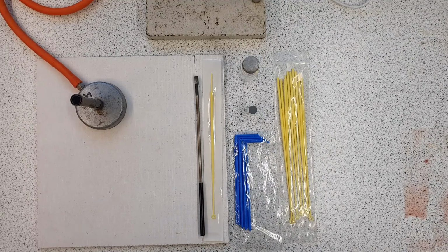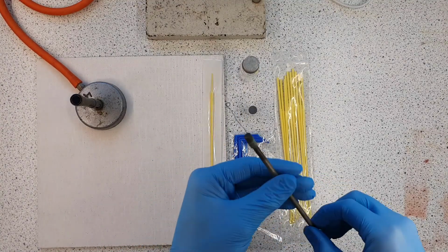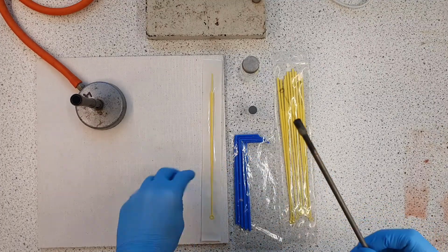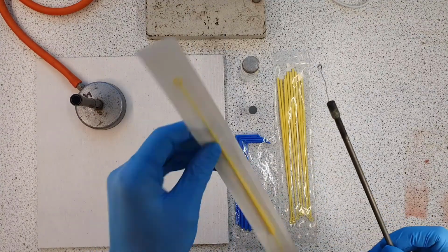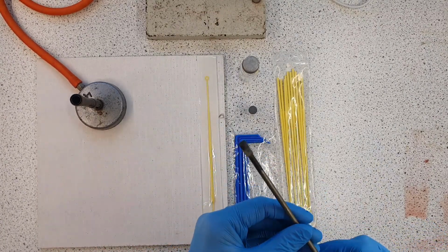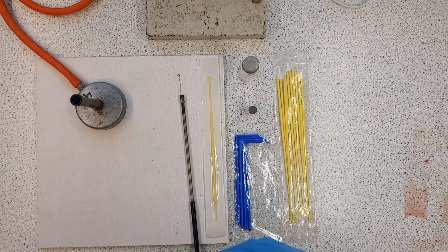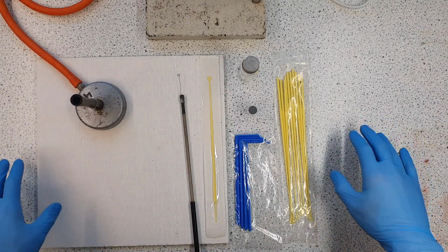And each step is fairly straightforward, and combined they massively reduce the chances of contamination, which in this case can be very harmful. So part of that is we've got all our equipment here. So we've got our metal loop here, or its plastic pre-sterilised counterpart, which is a yellow one here, or you can get blue ones as well, but we're using this for today. And we've got our pre-sterilised equipment, which is always good to have. If we can use that, we will, and if we can't, then we're going to sterilise it ourselves as we use it. So, common sense practices here.